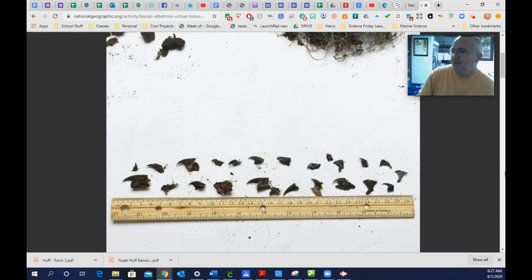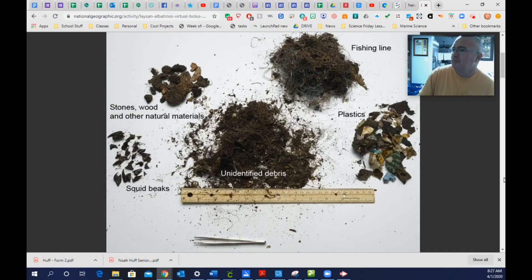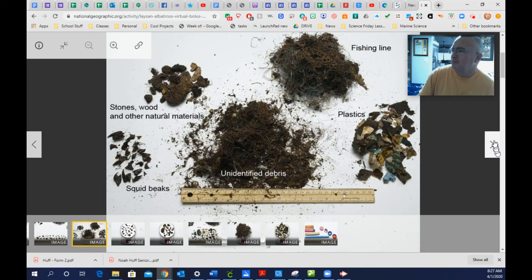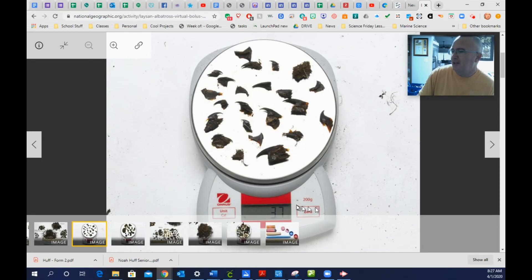These are all beaks from squids. Each squid has two pieces — two parts — to their beak. They're on the scale that's measuring in grams.